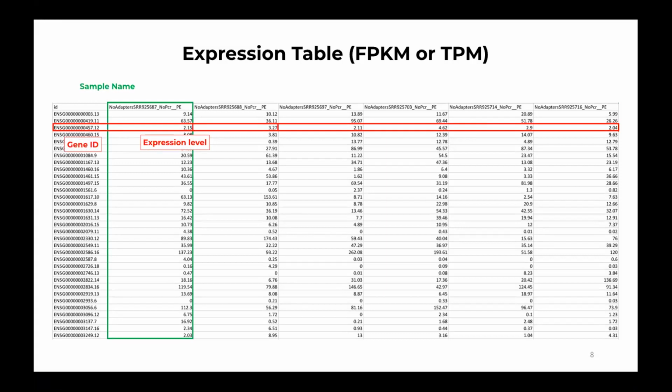Depending on the input data and the quantification approach we select, these numbers are reported as FPKM, RPM, TPM, or raw count units. We do not want to look at just the raw count. We want to look at the FPKM, TPM, or RPKM, whichever is the output. So the table contains thousands of genes and isoforms.